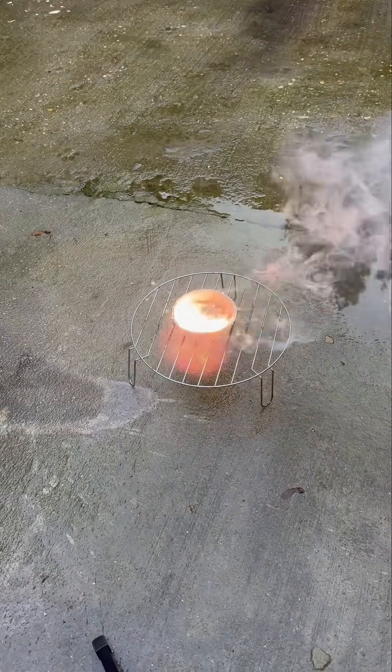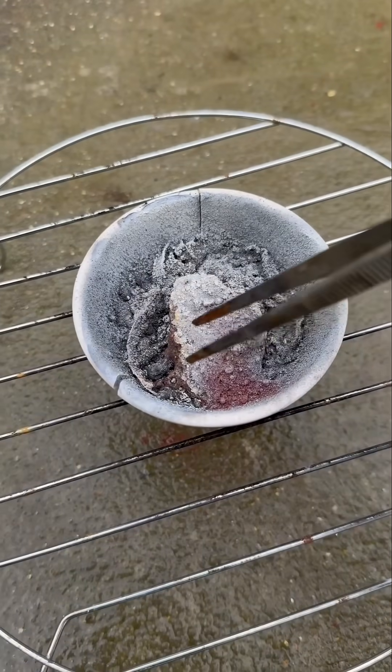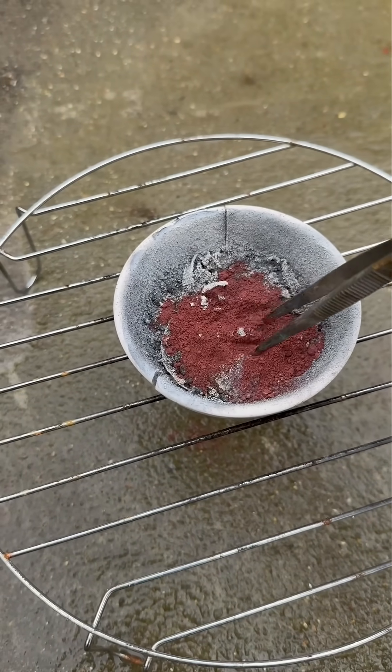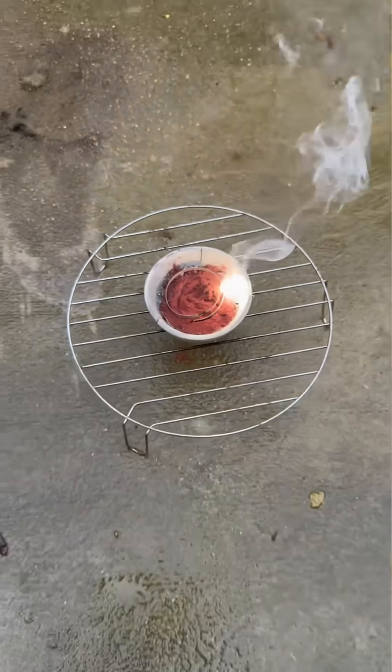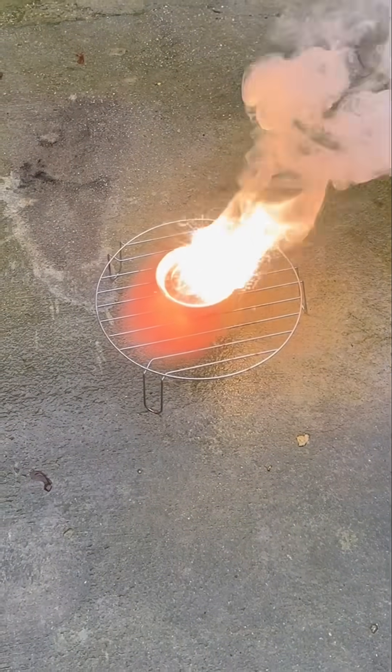Look at that — loads of fireworks and smoke! I poked the mixture and noticed there was quite a bit of unreacted material, so I put in another piece of magnesium and did the reaction again. Even more fireworks!